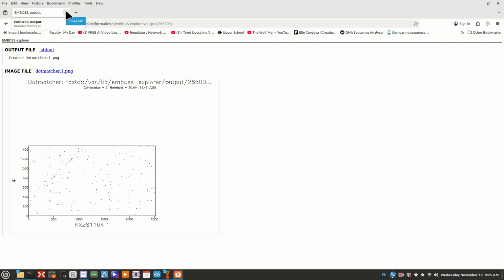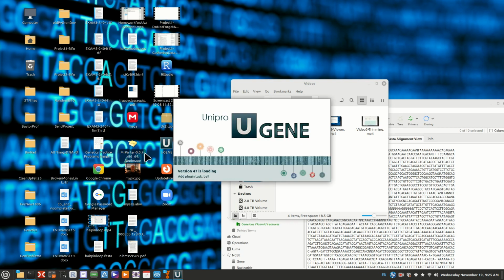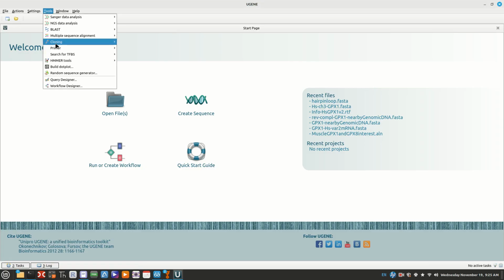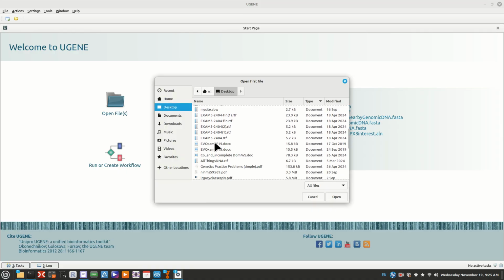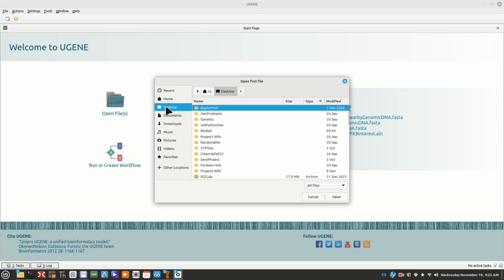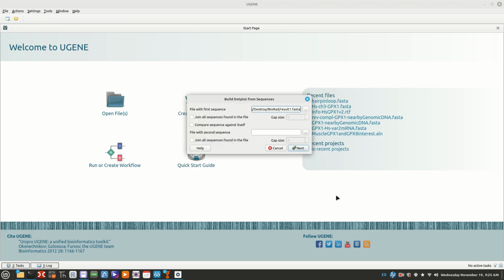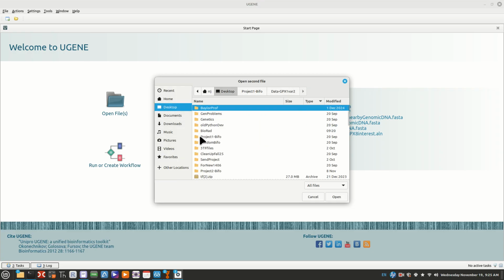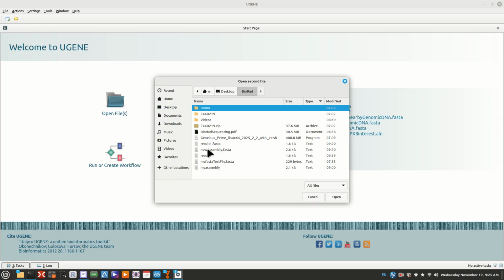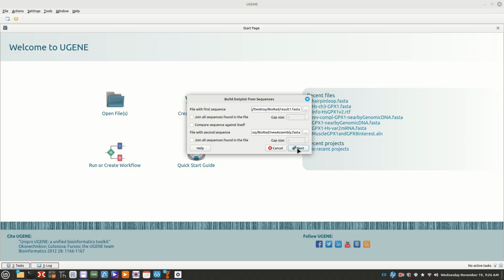Let's see if I can find a better dot plot program. I have one here. I'm just going to use the one I have. It's an old program. But let's put in this sequence. Where was that? That was under Biorad. And we need result 1. And we need new assembly. There we go. So here are 2.